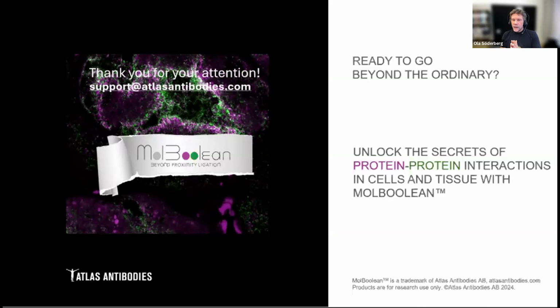You cannot see with any method if it's a physical interaction, but you will see if the proteins are close by, or the antibody-targeted proteins bind in close proximity. So if you have a situation where some cells have a low expression and you get the signals, and then you have really high protein expression in one or a few cells, you will maybe get the wrong impression of what happens. Then you can use the expression levels as a cue for saying that you might not be able to trust the interaction events recorded in this cell.